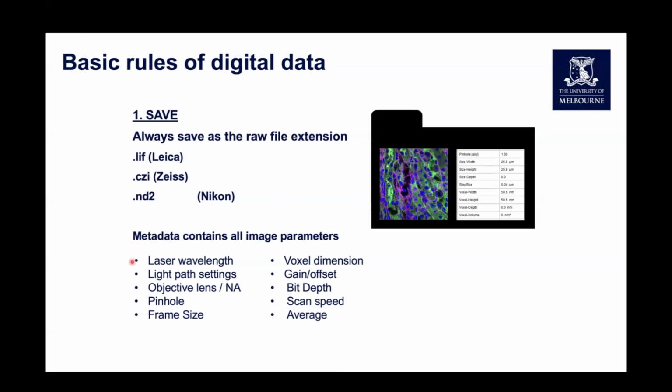So if a reviewer or your supervisor asks you, how did you acquire the data on a given day, you can go back to this file, open up the metadata, and it will tell you what lasers and what the microscope settings were, what your objective was, that type of thing. The other nice thing that allows you to do often is to reapply those settings again. So you're imaging the exact same way another day as you were the previous day.